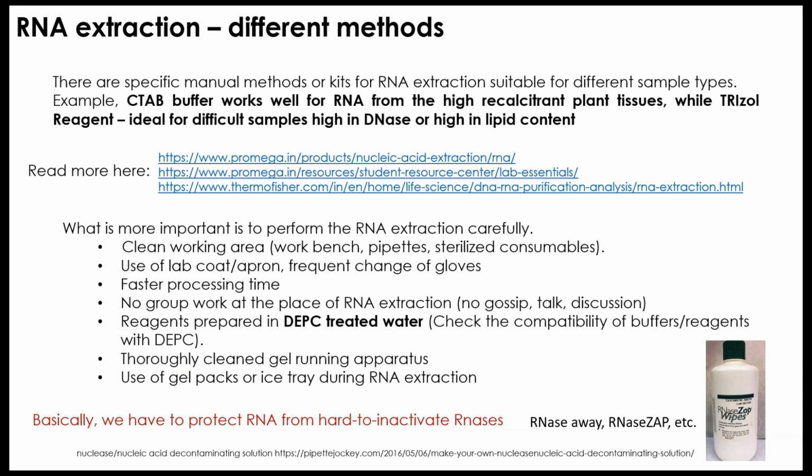Whichever method of RNA extraction you choose for your sample, what is important is that you have to be very careful. Careful means a clean working area, right? Workbench, pipettes, and sterilized consumables are all very much necessary. Use a lab coat or apron, and don't touch your clothes very much.